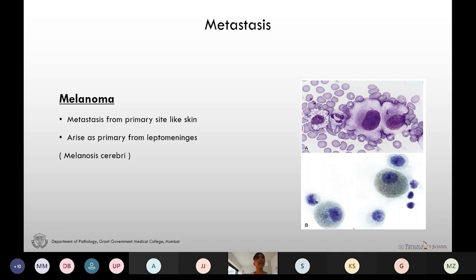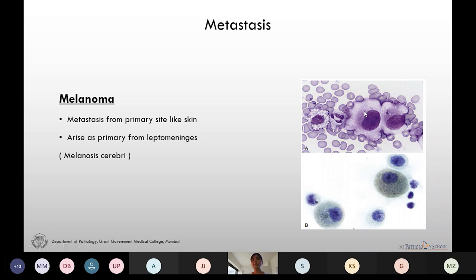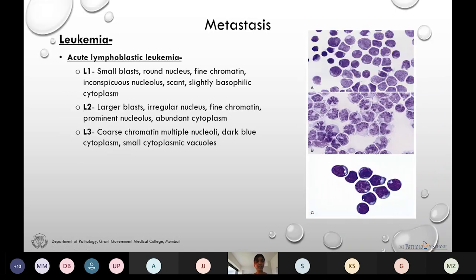Melanoma can be a metastasis from a primary site like skin, or it can arise primarily from the leptomeninges in cases of melanosis cerebri, where melanocytes are present in the leptomeninges. In this picture we see melanoma cells which are large cells with a big nucleus and prominent nucleoli. The melanin pigment may or may not be seen.